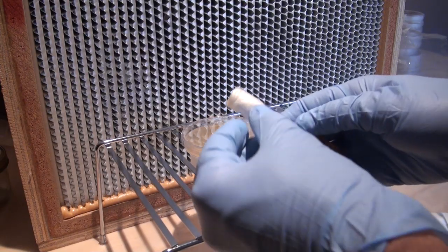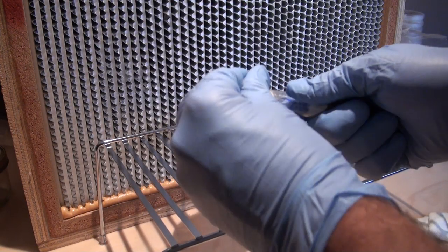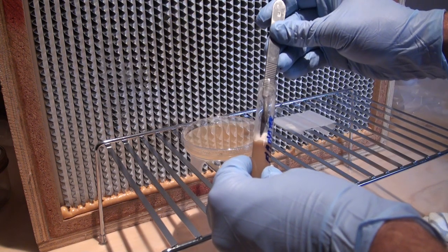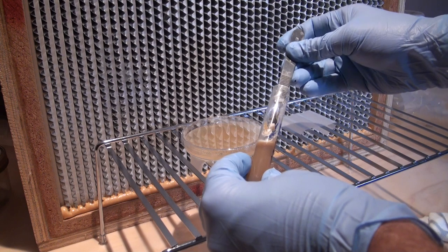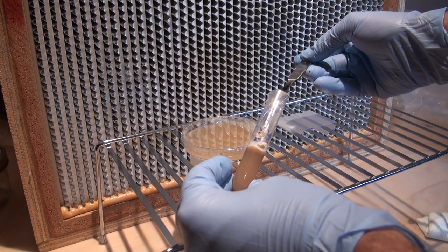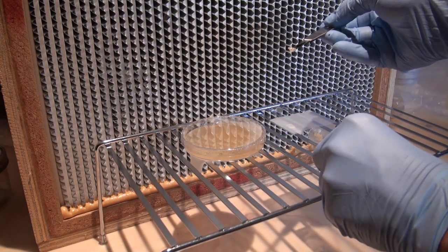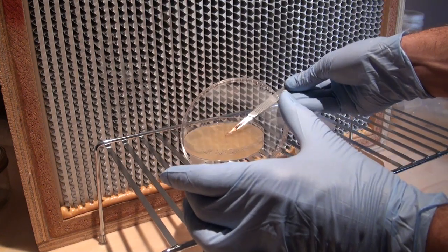You can also do a similar process with culture slants. Using your scalpel, dig out a piece of the culture and place that on your dish as well.